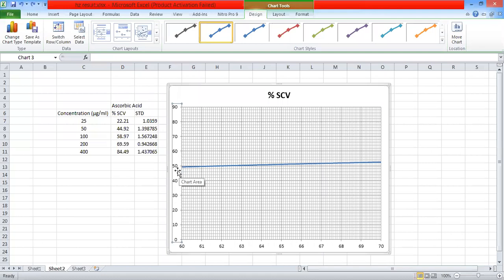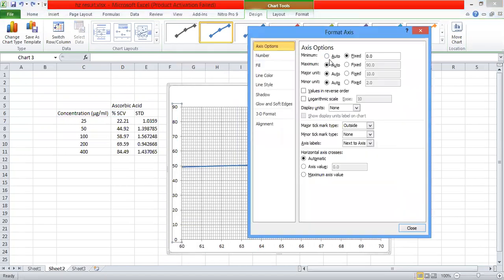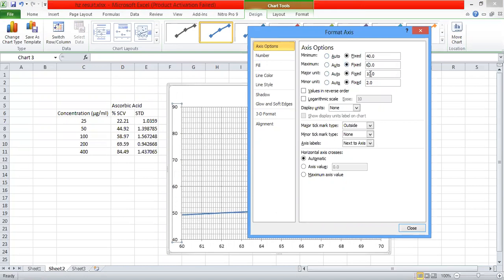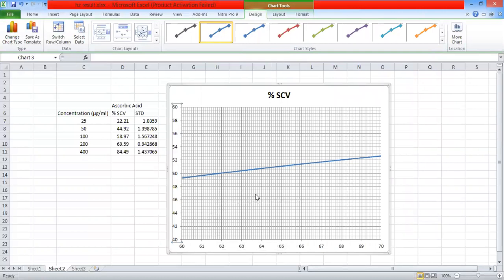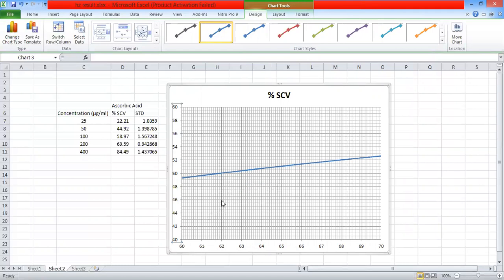For better understanding, I am going to split the Y axis as well. First, I have to select it, then right-click and choose Format Axis. I am going to use fixed values from 40 to 60. I'll set the major unit to 2 and the minor unit to 0.5. After this, we can see that the IC50 lies more closely between 61 and 62 — it crosses the line just before 62, at approximately 61.5.